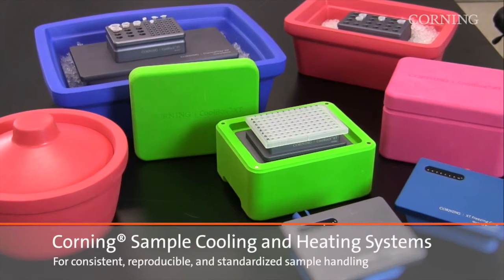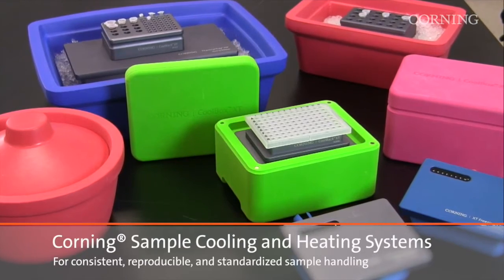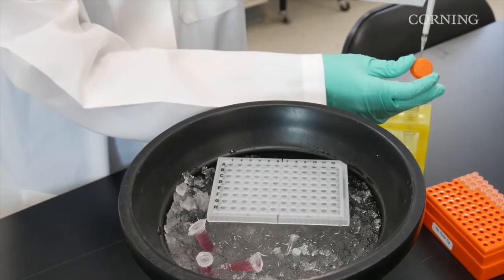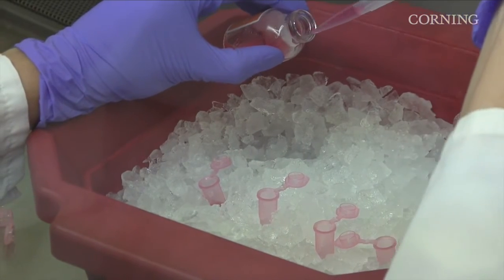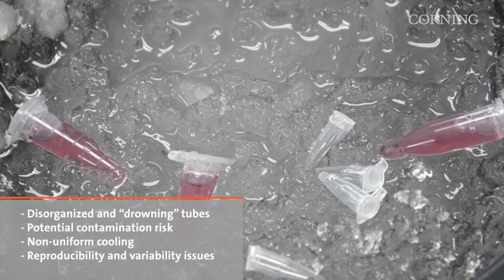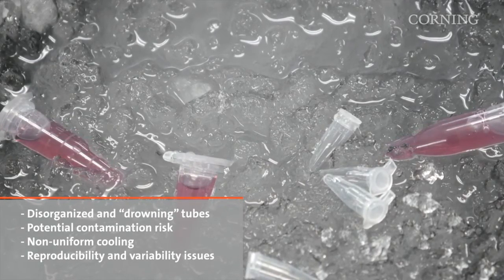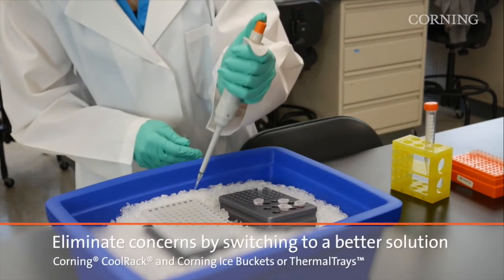Corning sample cooling and heating systems are a family of solutions that enables consistent, reproducible, and standardized sample handling. Ice buckets are part of every lab and can be found on almost every bench, typically used to keep samples cool while you work by placing tubes or plates directly on ice. This method, while good enough, may actually present many problems such as disorganized tubes that drown as ice melts, a potential contamination risk posed by ice, non-uniform cooling as ice melts, and issues with reproducibility and variability.